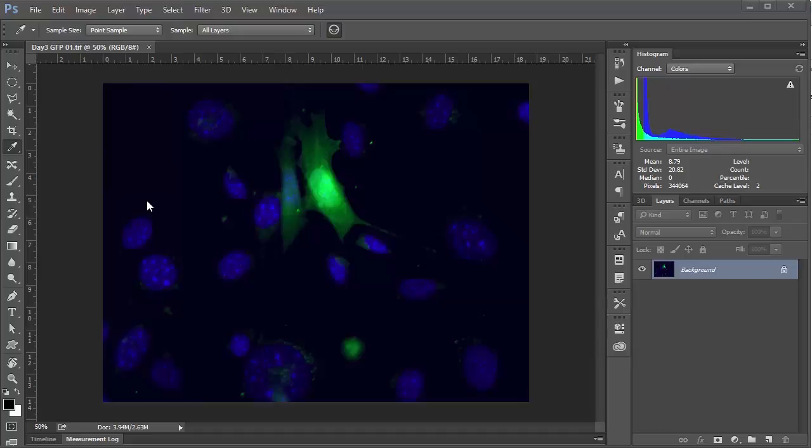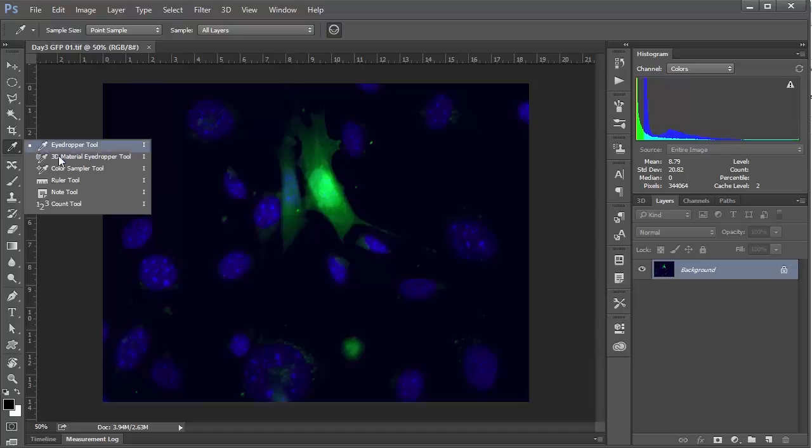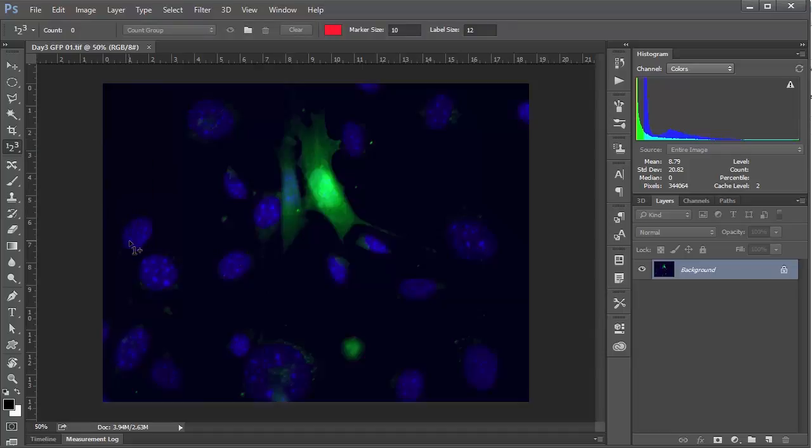So to get to the count tool, we can click and hold the eyedropper tool and select count tool, and then you just click whatever it is you want to count. And so I'll count a few of these cells here.